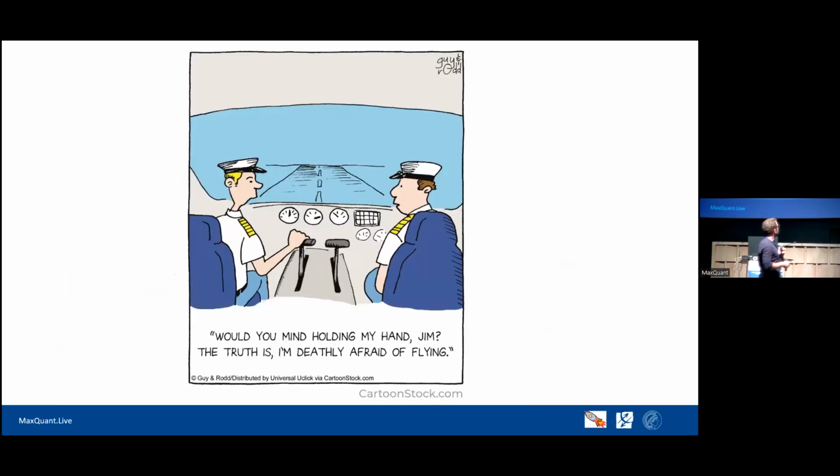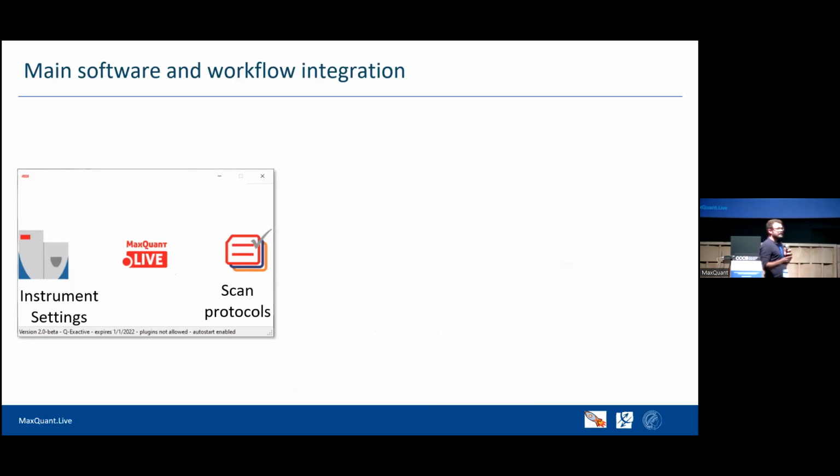Very nice. So probably you liked it and want to try it out, but it sounds a bit complicated. Don't be scared, it's actually very easy. It has a graphical user interface, so it's not running on the command line. It's very clean, with three buttons. This is the main window.